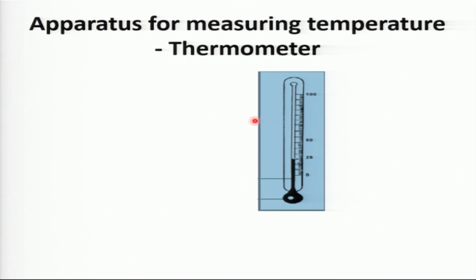Is that clear? So we need to be having a thermometer in a chemistry laboratory, because as we start to work, you first measure the temperature you're working in. For example, you're doing one paper in Rwanda or in another country, you're doing the same paper, but some people are working from here. Other students in another school are working at a different temperature, maybe it's raining in that area or like that.